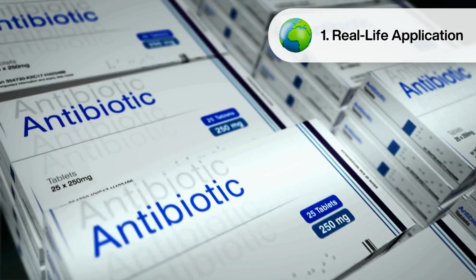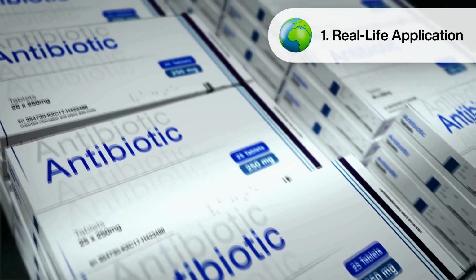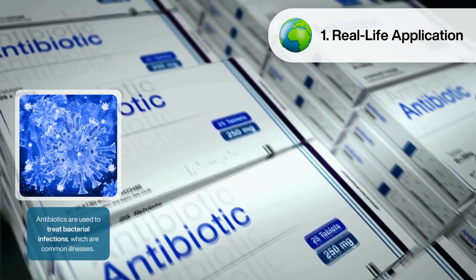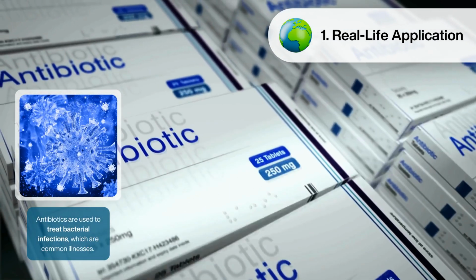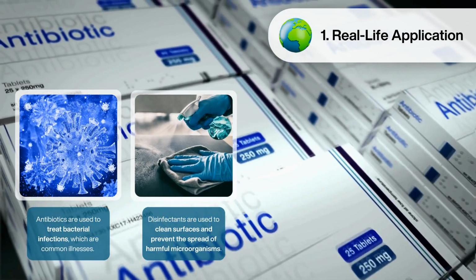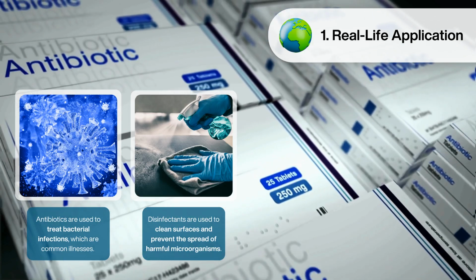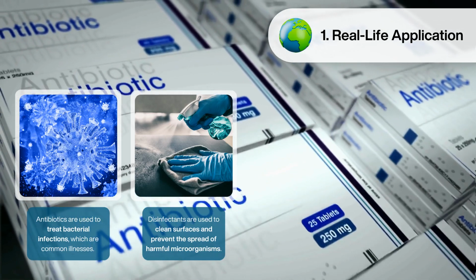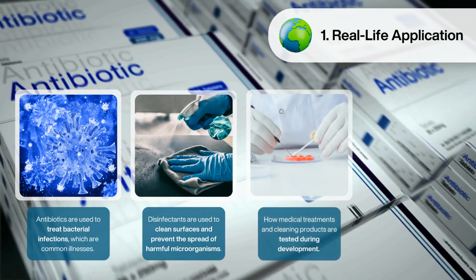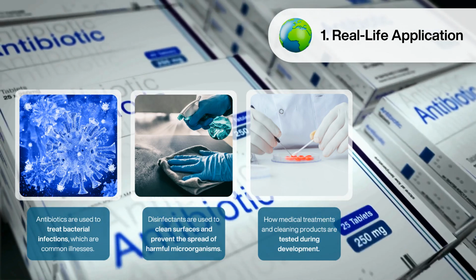Understanding how antibiotics and disinfectants affect bacteria is incredibly relevant to our daily lives. Antibiotics are used to treat bacterial infections, which are common illnesses, whilst disinfectants are used to clean surfaces and prevent the spread of harmful microorganisms. By learning how to test these substances on cultured bacteria, you gain insight into how medical treatments and cleaning products are tested during development.